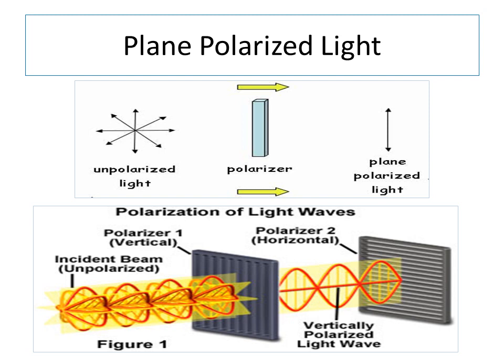So in this diagram we look at unpolarized light. It goes through a polarizer and forms plane polarized light. So polarization of light waves can occur using what's called polarizers. So these are just diagrams to explain what a polarizer does and what plane polarized light looks like.